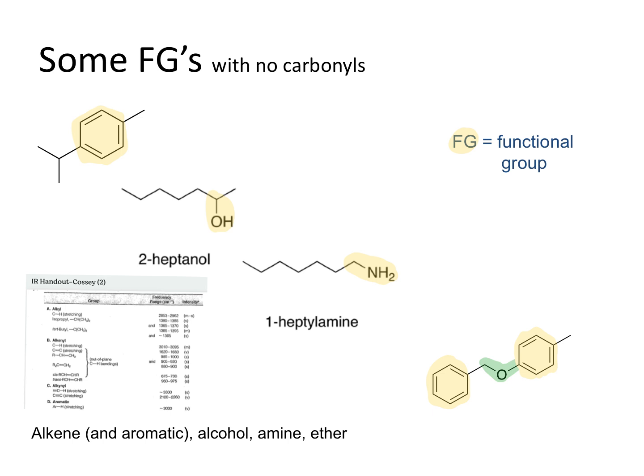Another thing you want to do before we get too far is make sure that you have a handout that has the listed peaks that we're looking for. There's numbers that go with each of these peaks and their shapes. I'm going to show you the shapes, but for the numbers, you want to look on the IR handout. For Dr. Cossey's class, you always have a handout that has the numbers, so you don't have to worry about those, but you want to make sure you get that. If you look in the bottom corner, there's a little picture of what you may have. It should look something like this. On the left, it'll say the name of the thing. It'll have a picture of the bond you're looking for, and then on the right, it'll have the numbers where you're going to look. Okay, so make sure you have that available.